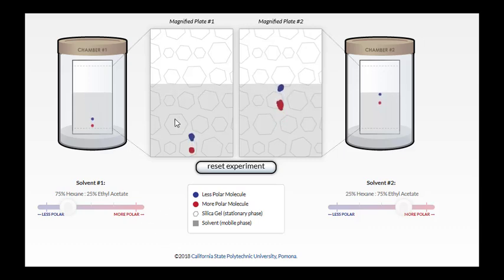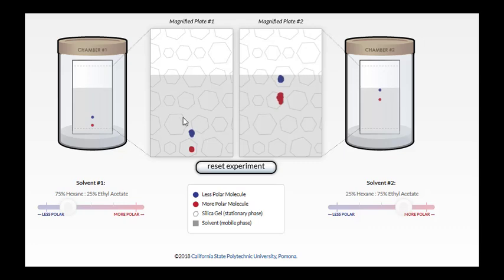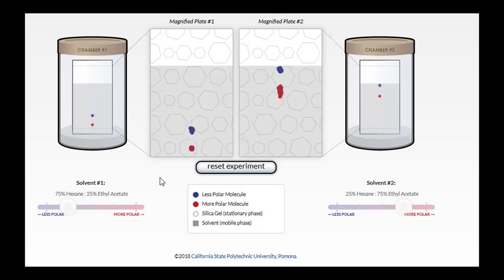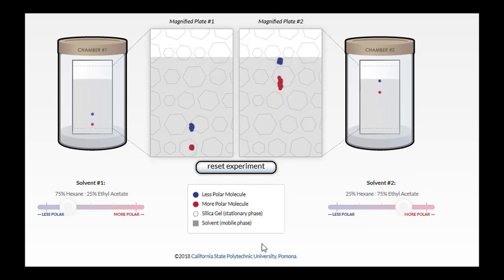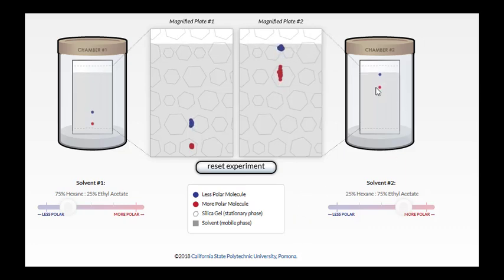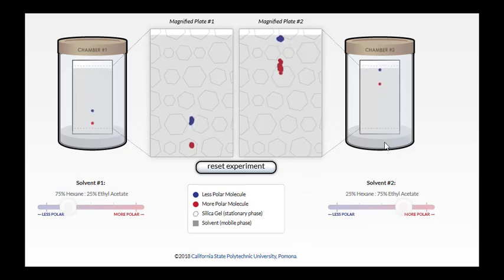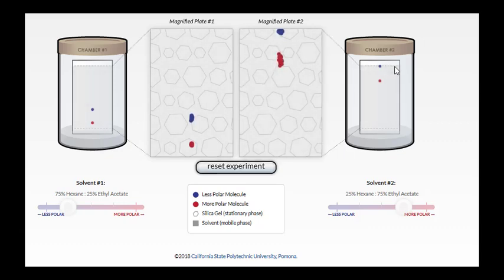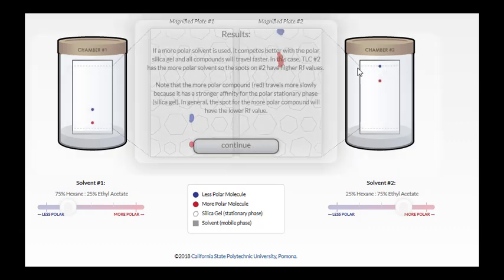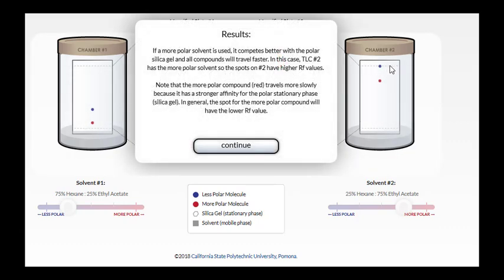And so ultimately, they're going to have a higher RF. With a less polar solvent, the compounds are traveling more slowly. So when we're all done, we're going to have higher RFs with the more polar solvent. And we're going to let the solvent rise until it almost reaches the top of the plate. We'll mark that spot. We'll mark that level, and that's how we can measure RFs.